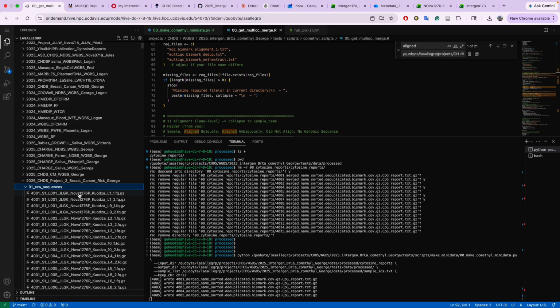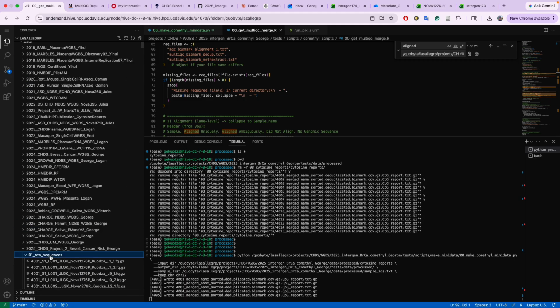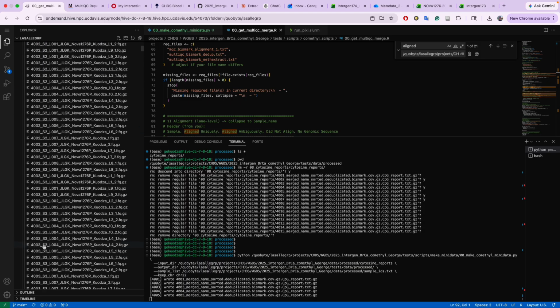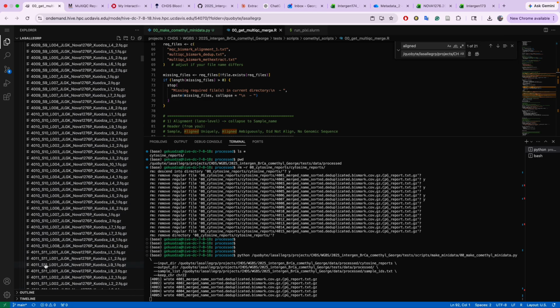All right, so the sequencing number is this number that's written as S. So that's like sample 1, 2, 3, 4, 5, 6. For these samples, based on chronological order, they're not really that different.